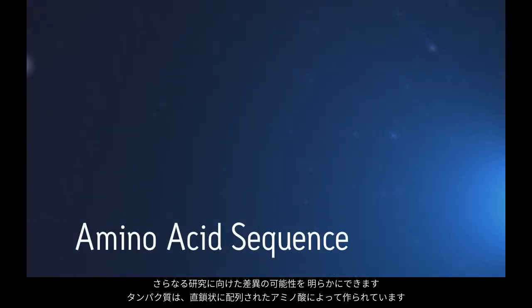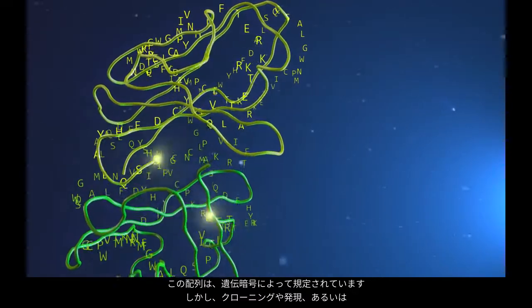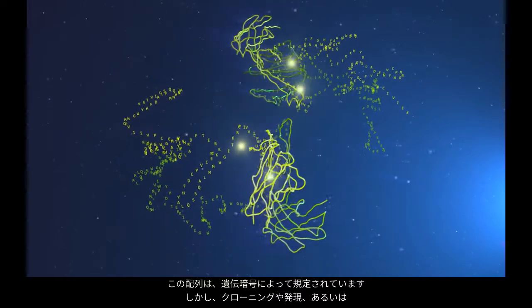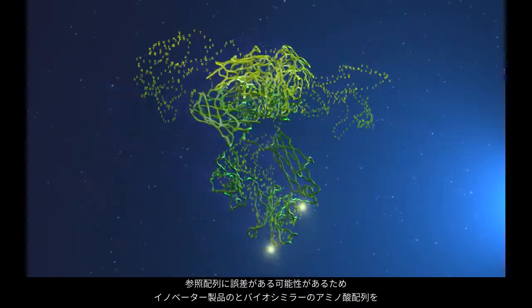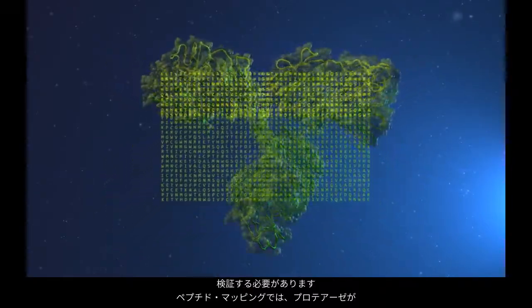A protein is constructed from a linear sequence of amino acids. That sequence is specified by the genetic code, but the potential for errors in cloning, expression, or in the reference sequence means that the amino acid sequence of innovator and biosimilar must be verified.